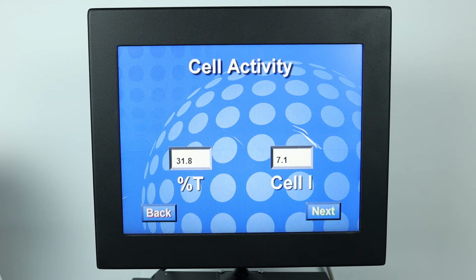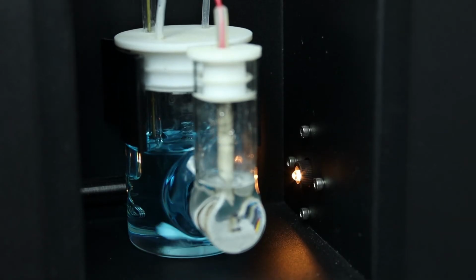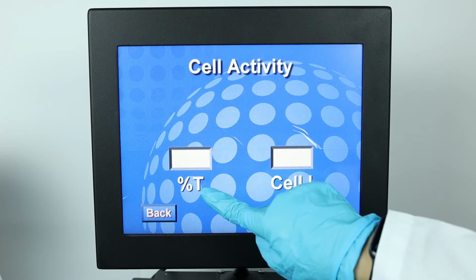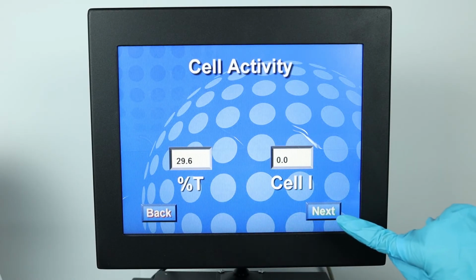While waiting for the transparency to decrease, we recommend leaving the coulometer 45 minutes to an hour, even though 29.5 will be reached relatively quickly. This leaves enough time for the system to stabilize. After waiting for this period, the cathode compartment contents should be blue. Percent T should be 29.5, and the system is stable and ready.